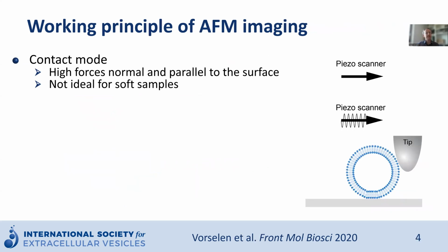So for imaging, it's important to know that AFM can be used in multiple modes. The simplest is called contact mode. In this mode, the tip is simply dragged along the surface while the tip height is adjusted to maintain a constant deflection of the cantilever. So this mode results in both high forces normal and parallel to the target surface, and therefore it is really not ideal for soft samples like EVs.